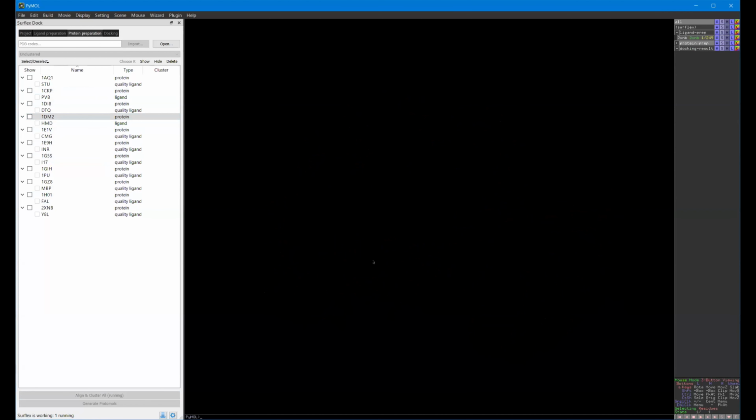So while this alignment is taking place, I want to take a few seconds to discuss PSIM. PSIM is our protein pocket similarity algorithm. Notice I didn't say protein similarity. PSIM does not align proteins based on the carbon backbone. It aligns them in a manner that's akin to ESIM similarity. The ESIM algorithm is looking at small molecule ligands from the perspective of a protein. The PSIM algorithm is simply the flip of that, where you're looking at the protein binding pocket from the perspective of potential ligands.